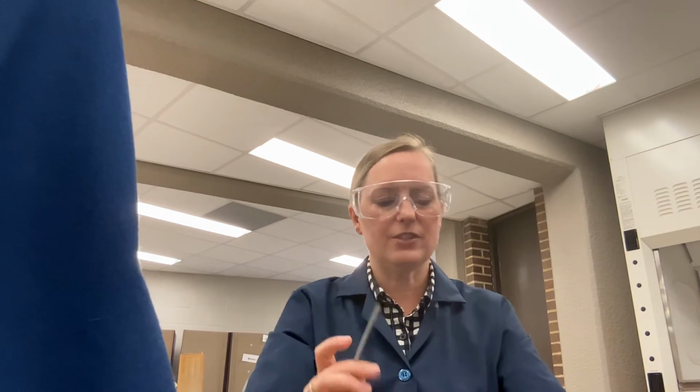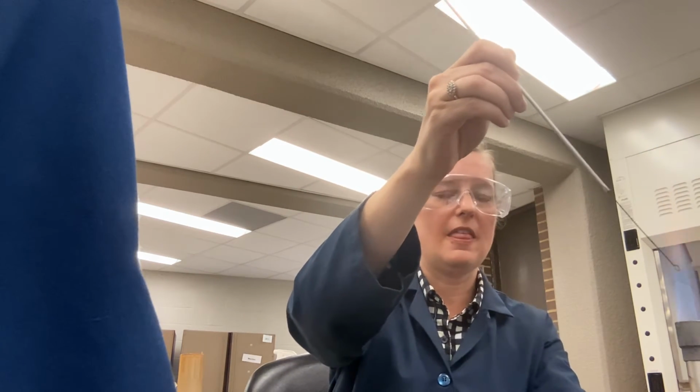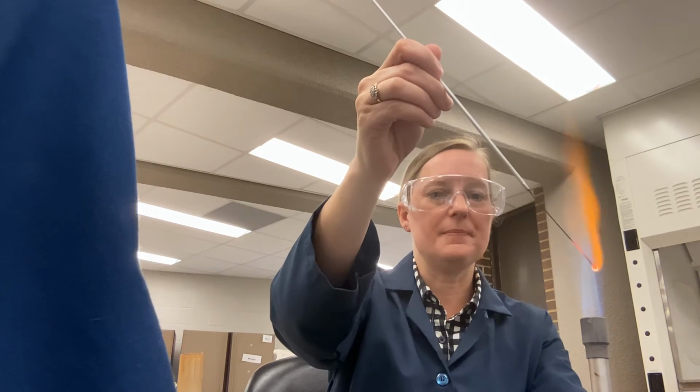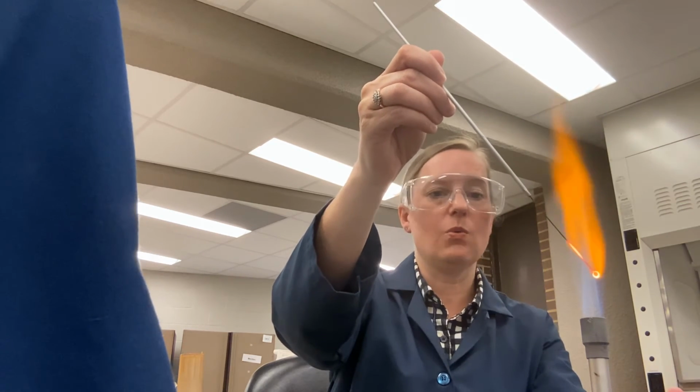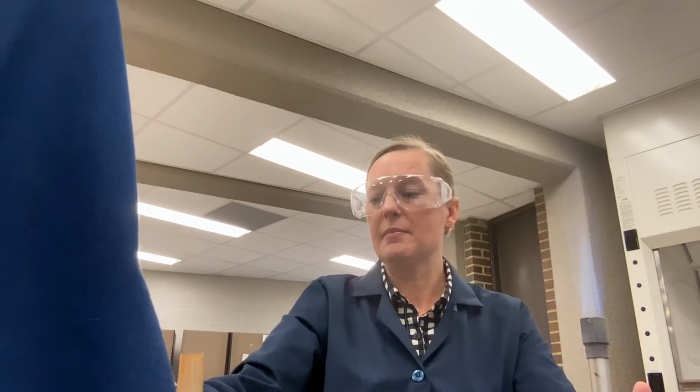Before I put this away, I've got bacteria on my loop, so I'm going to flame the loop one last time. Remember, I only got 1 loop of bacteria total. That was it, just that one little bit. Believe it or not, we'll grow a ton in just that one little bit. I'm going to go ahead and turn the Bunsen burner off, because when we don't need it, we're going to turn it off. And I'm going to show you what this plate looks like.